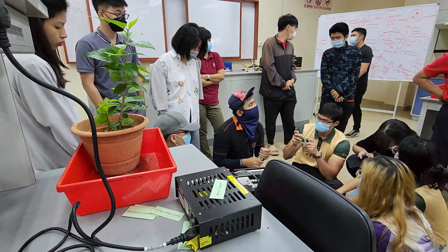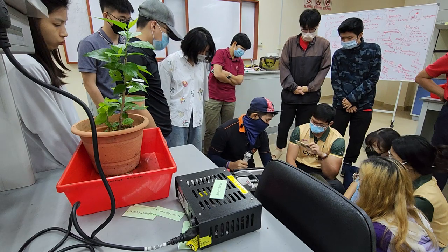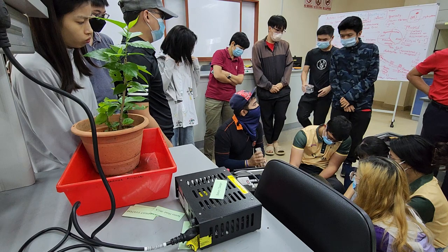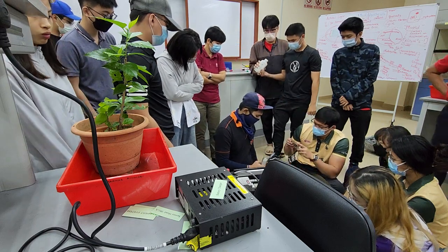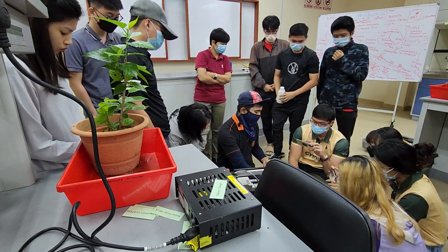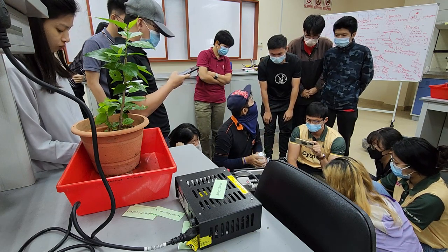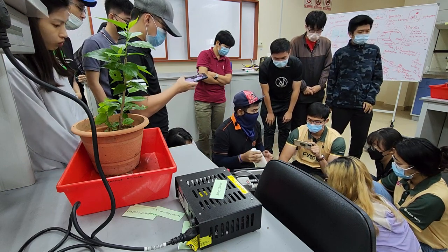Itulah, the container mah. Tak apa lah, kita simpan kejap. Sebab dia, this thing got a color change as well, but not as much as this. Kadang macam wonder kenapa okay. Kejap ni sebab dia ni wet, kalau wet boleh jadi dia expire. Wet is reactive, itulah.